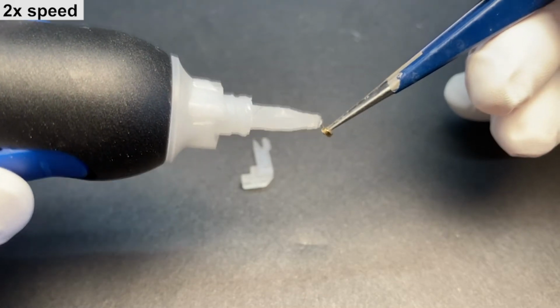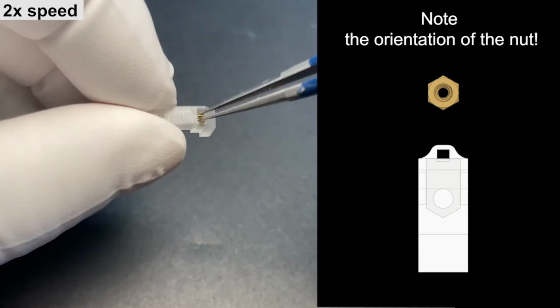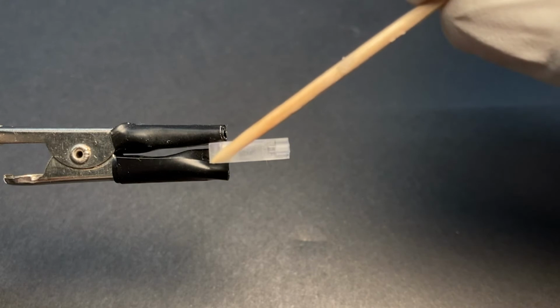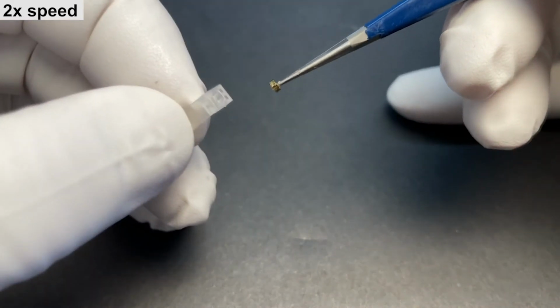And then once those two components are built together, we can insert another nut into these so-called shell components. But again, you need to make sure that the orientation is right. And this part will be cemented to the skull of the animal. And then this nut we need to seal, basically create a watertight seal. So first we seal it with Play-Doh, and then we cover this Play-Doh with cement. The purpose of this step is just to prevent, during surgery, any cement flowing into that nut, which would prevent the recovery of the drive.